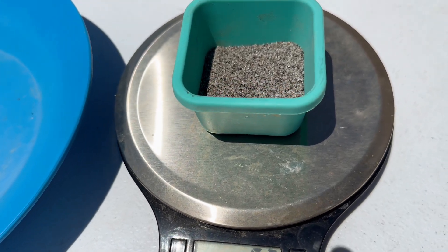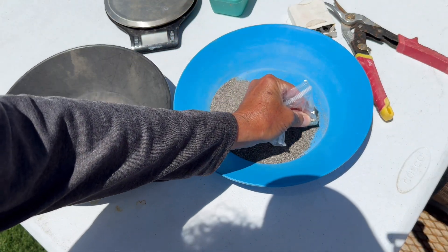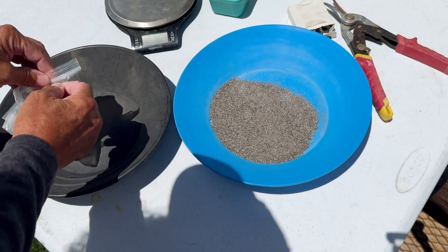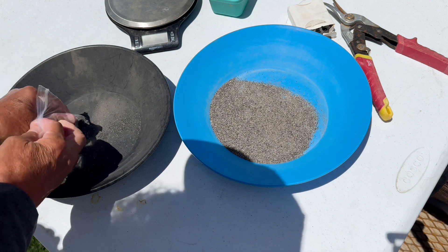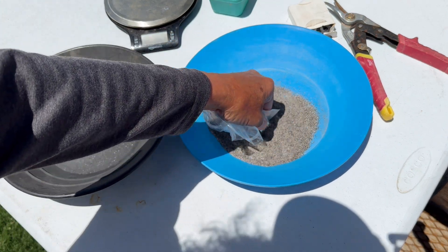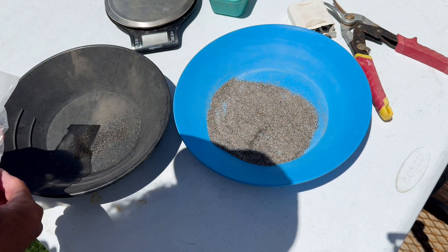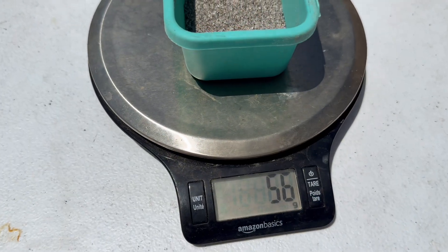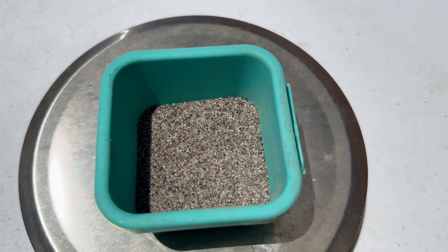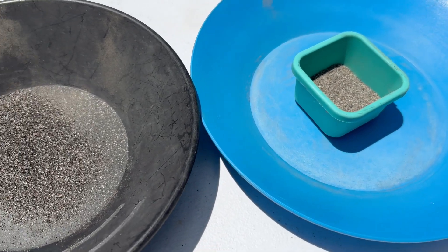Here is our black sand concentrate and it weighs 67 grams. We are going to use this strong magnet — I put it in a plastic bag so when the sand sticks to the magnet I can pull the magnet out and the sand drops off the plastic bag. We have 56 grams of concentrate to work with. In the black gold pan is the iron that we pulled out of our concentrate, and in the green tub is our concentrate.